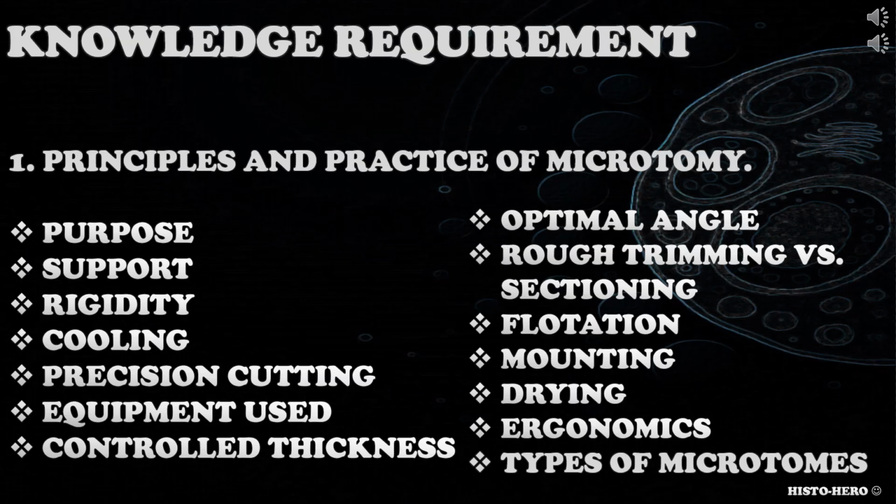When addressing this knowledge requirement, candidates should consider purpose of microtomy, tissue support and tissue rigidity, cooling of blocks, precision cutting, equipment used, controlled section thickness, optimal angle, rough trimming versus sectioning, section flotation and flattening, section mounting, ergonomic setup, types of microtomes used and so on.